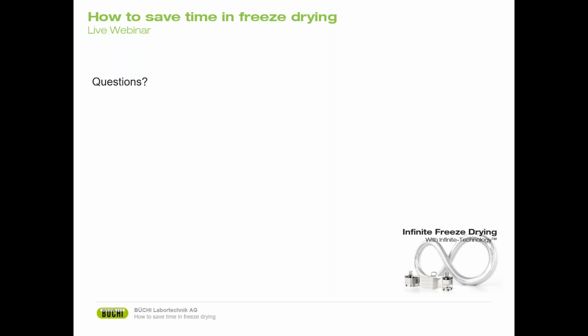You mentioned that higher pressure will speed up the freeze drying process. But what is the maximum pressure that can be used, and what is the ideal pressure? That often very much depends on the sample. As we said before, you always have to think about the collapse temperature.